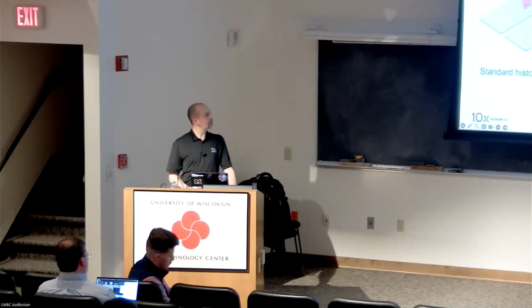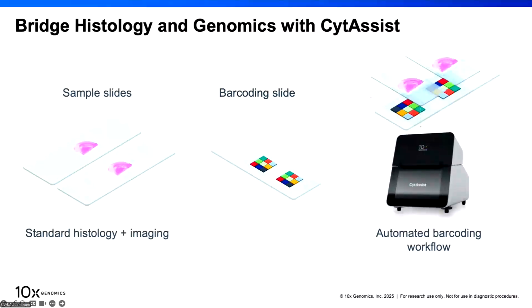Yeah, so again, the question is, if I have archived samples, already sectioned on a slide, I would say it depends. Visium is compatible with that type of slide, that type of sample. We will still be testing the RNA quality. We have a protocol. Essentially, what we do is we scrape a little bit of tissue and we measure the RNA.